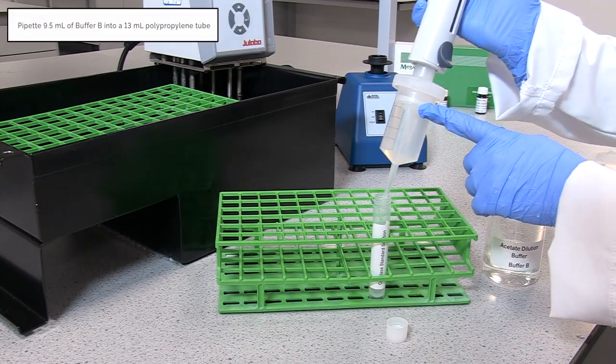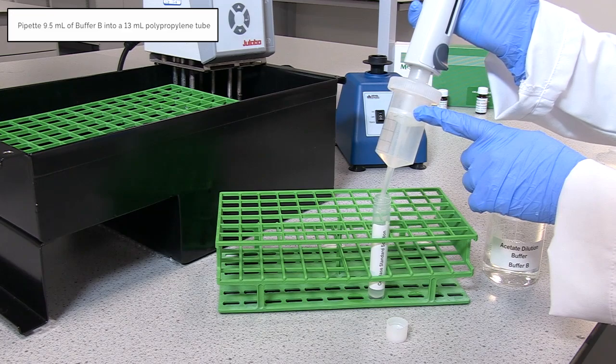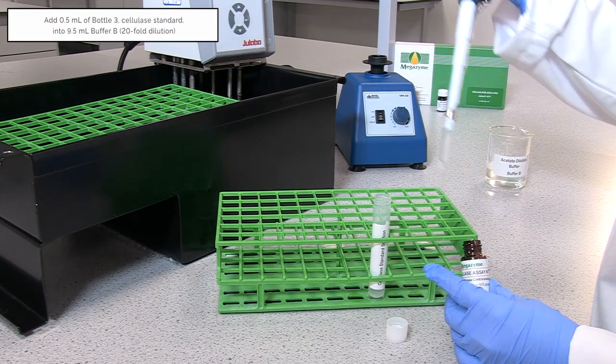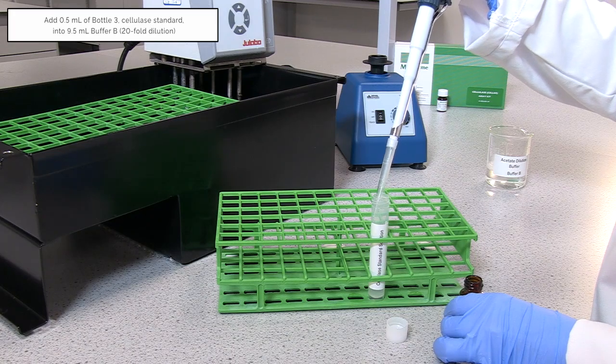Dispense 9.5 millilitres of buffer B into a 13 millilitre polypropylene tube. Add 0.5 millilitres of Bottle 3 into buffer B and vortex to mix.